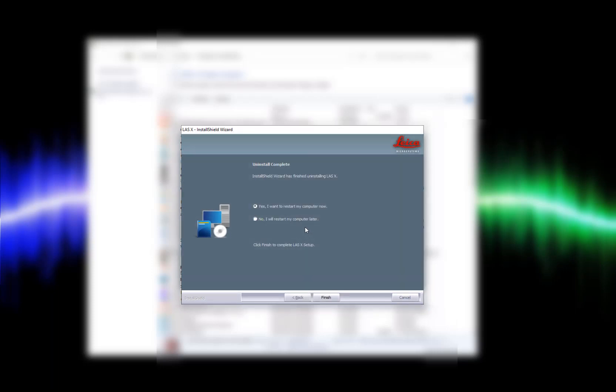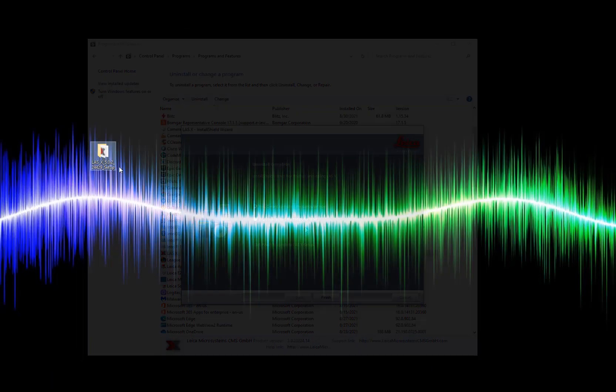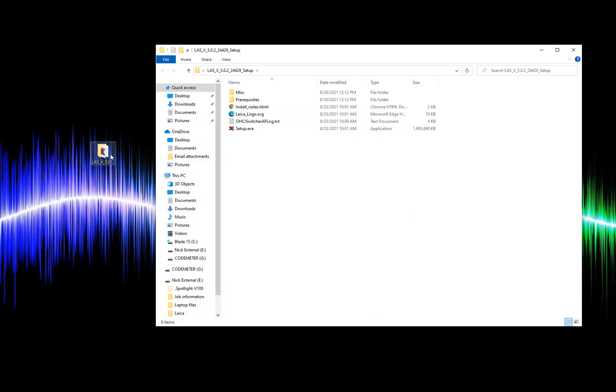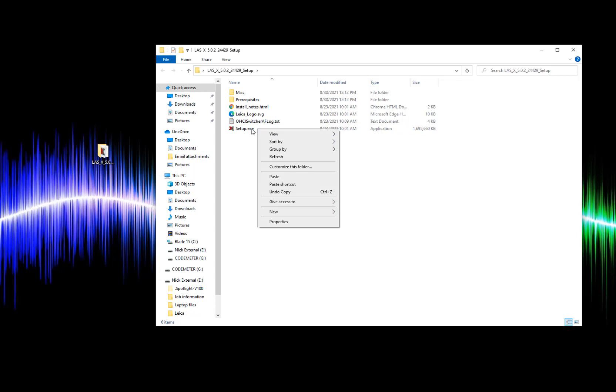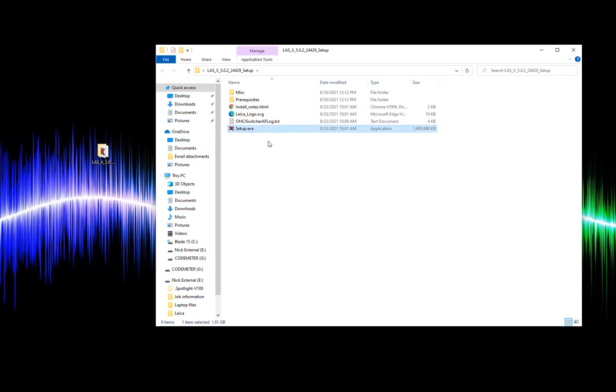The final step is to restart your computer. After restarting my computer I can open my LASX 5 installer files. From here we're going to run the setup application as administrator.